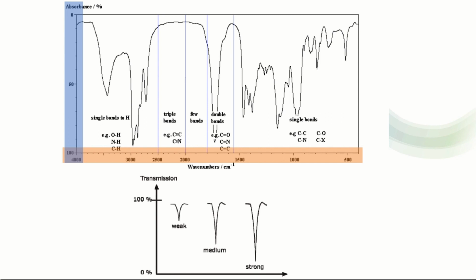So this indicates the presence of some particular functional groups in the compound, some functional groups in the sample that can absorb the IR wavelengths. So this information is here to tell us what kind of bonds are present in the compound.